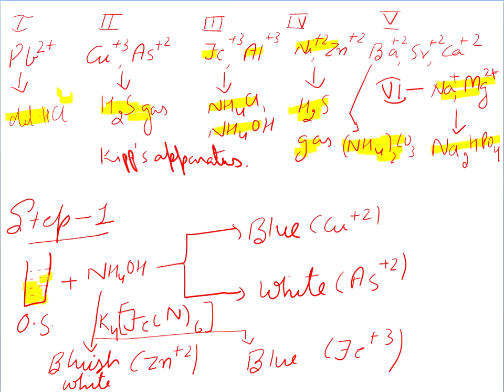If it is not dissolved, you can heat it. After some time it can be dissolved. Okay, there are some chances it will be dissolved automatically, but if it will not dissolve, you should heat it. You prepare OS, original solution, plus you have to add NH4OH, ammonium hydroxide.